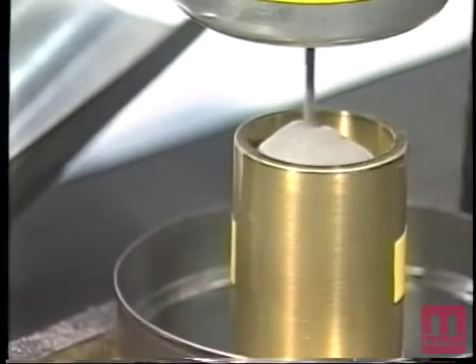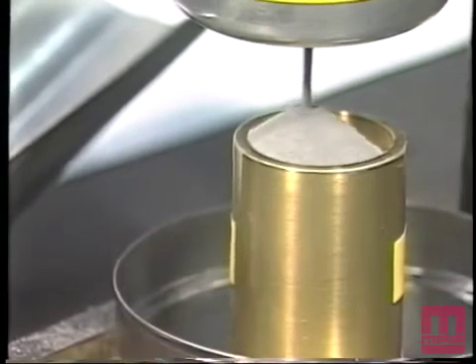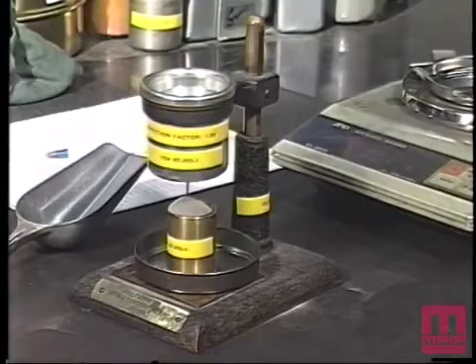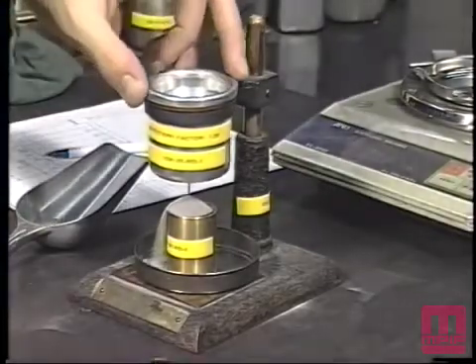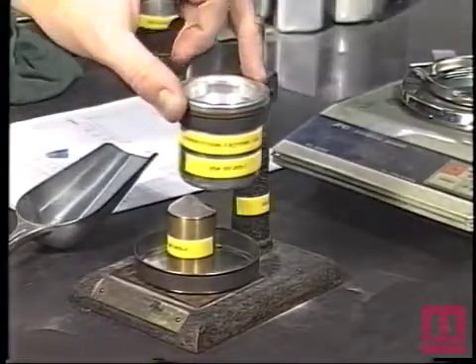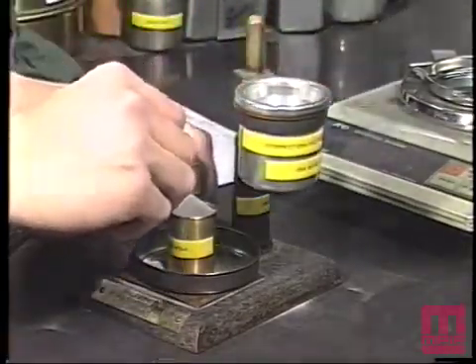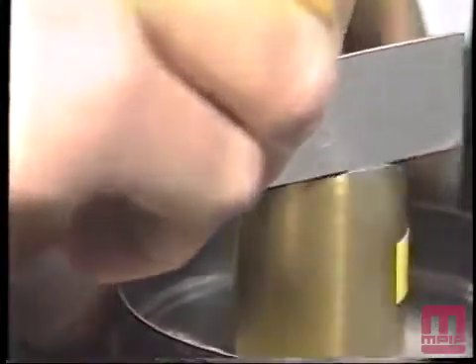When the powder completely fills and overflows the periphery of the density cup, the funnel shall be rotated approximately 90 degrees in a horizontal plane so that the remaining powder falls away from the cup. Using a non-magnetic spatula with a blade held perpendicular to the top of the cup, the powder shall be leveled off flush with the top of the density cup.